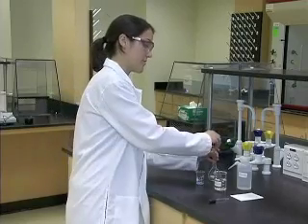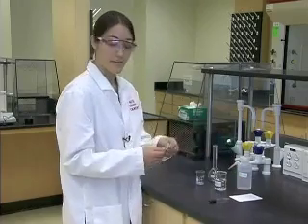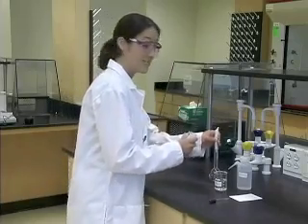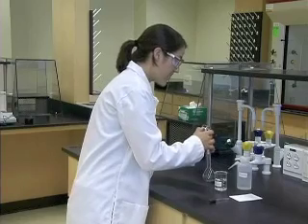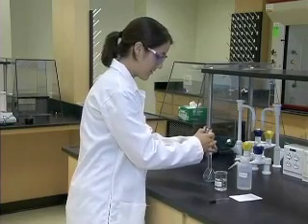Our first step is to remove the cork and take our piece of paper to make a funnel. We will use this funnel to add our solid to the volumetric flask, like so. We will then tap the funnel to make sure that all of the solid is into the volumetric flask.